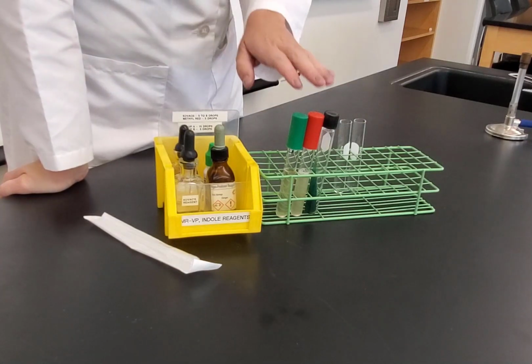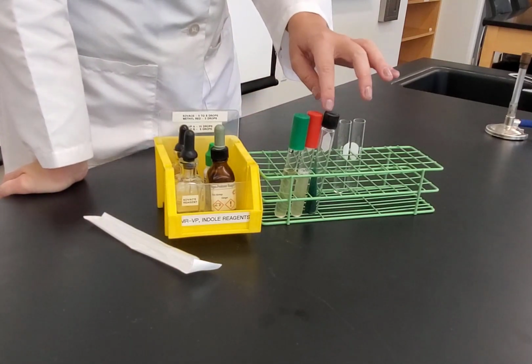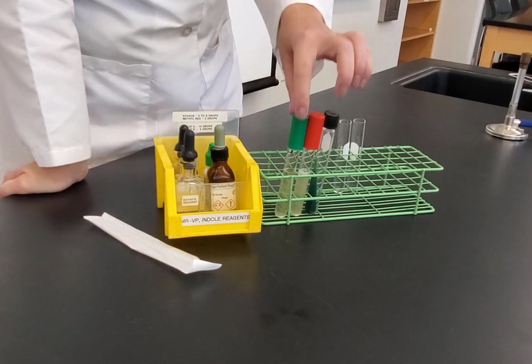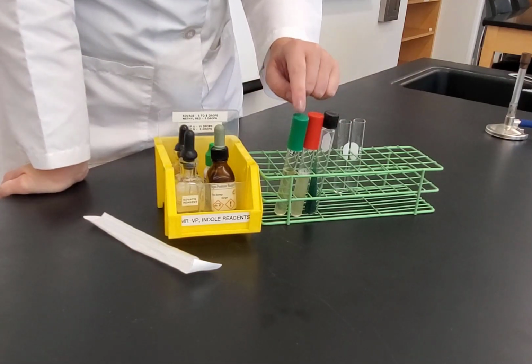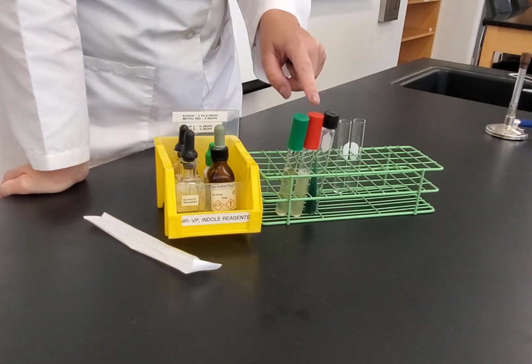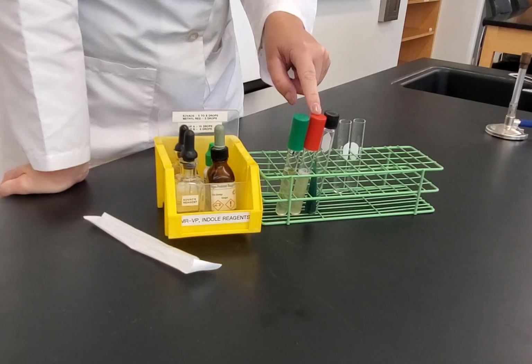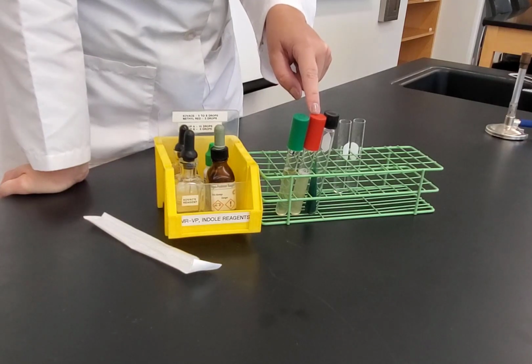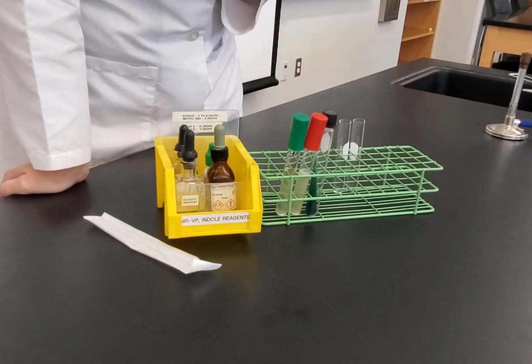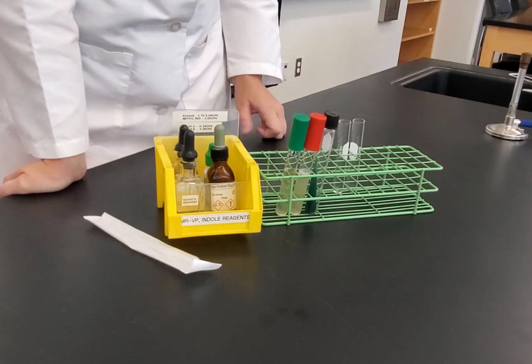So what you do is after the 48 hours, you're going to have your 3 tubes for each organism. So these are my 3 E. coli tubes. I have one with the green cap. Remember, this is my tryptophan broth. This is looking for my indole production. I have my red cap. This is my MR-VP broth. This is used for both the MR and the VP test. And then my citrate slant.